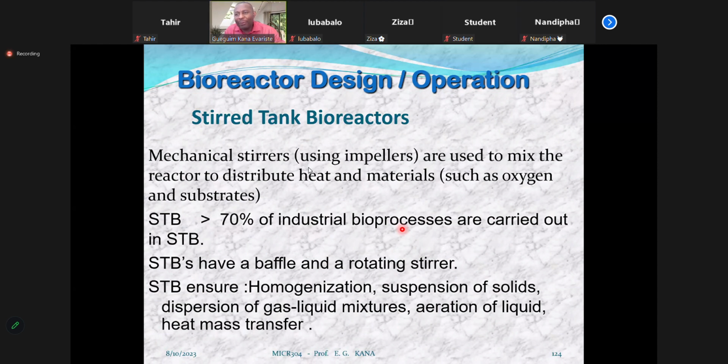Again, you have at least 2 types of reactors that are involved. They're also bioreactors. We're going to see those. You have the photoreactor. The photoreactor will look a little bit like the continuous stirred-tank reactor, but you're going to have the source of light. Then you have the raceway pond, which is also a reactor, a different type of reactor. Those 2 reactors are used for microalgae. That is, they're also referred to as bioreactors.